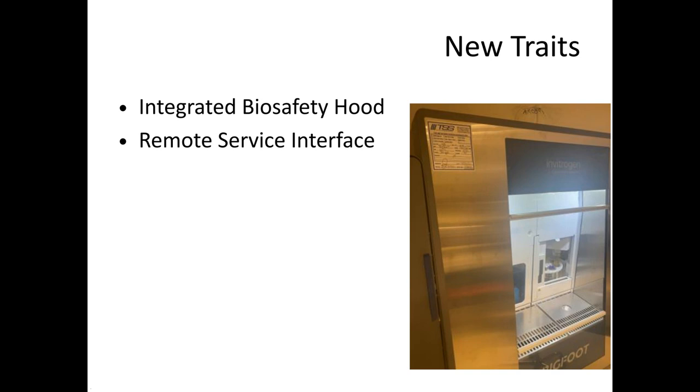Yeah, I can't argue that it nominally increased the safety of doing this, but I feel like good PPE practice and all those things before, it was never really that big an issue. And then to suddenly be decreed, oh, every sorter now needs to be in a hood if anything's even remotely BSL more than one. Okay, so in this case, the actual whole sample handling area is encased in its own hood. If you look here, I actually showed you, we had the TSS people come in and they actually certified it. So this is a functioning laminar flow hood, which is just a boon for safety. And the fact that it fits into a relatively small footprint instrument and doesn't affect access and serviceability, that's just awesome.